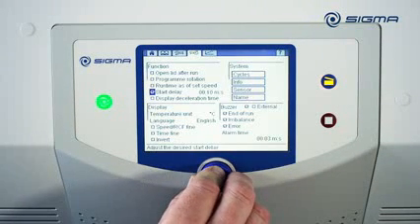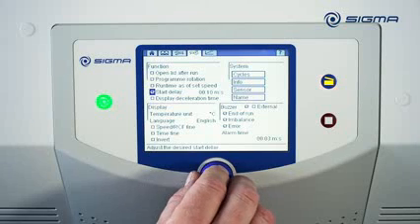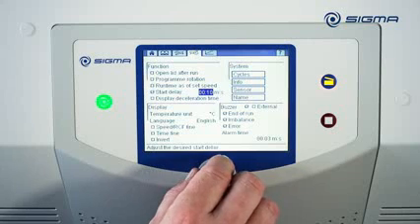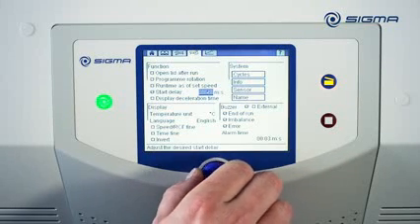If the Start Delay option is enabled, the centrifuge waits for the delay time to end before starting the actual centrifugation run. This time is configurable.